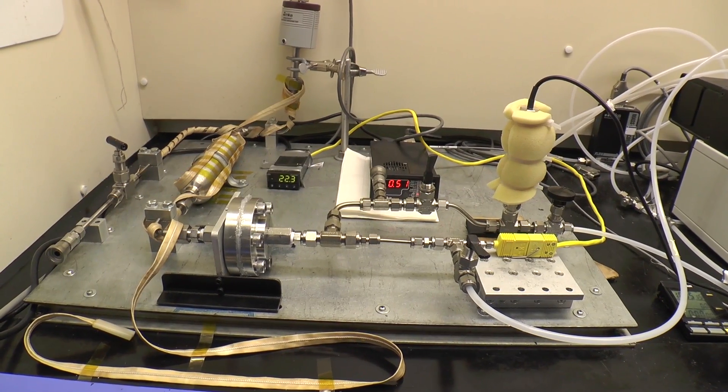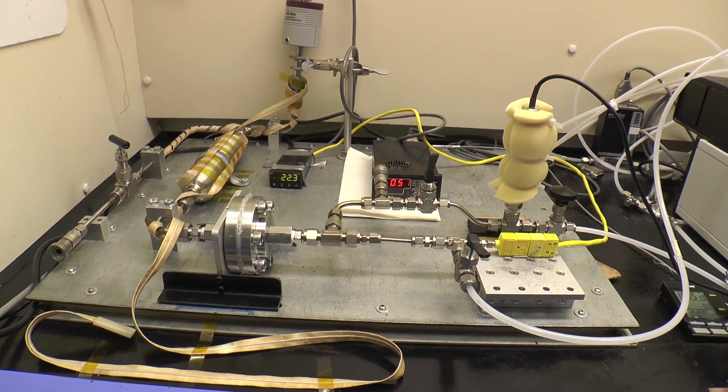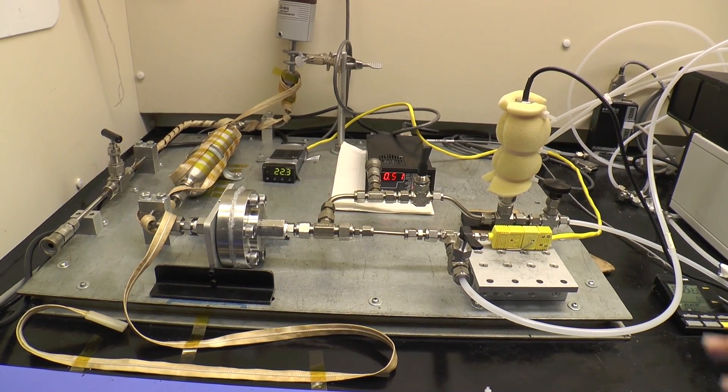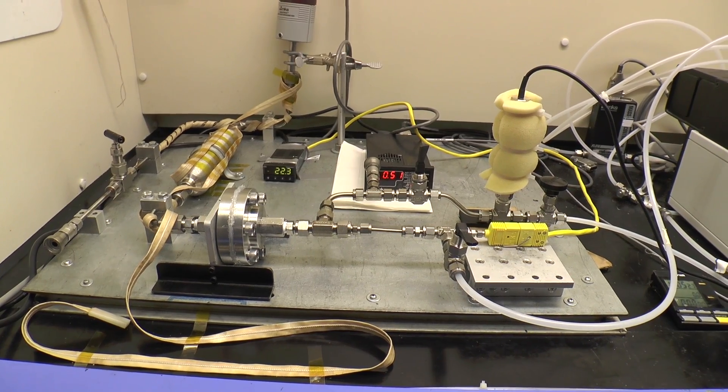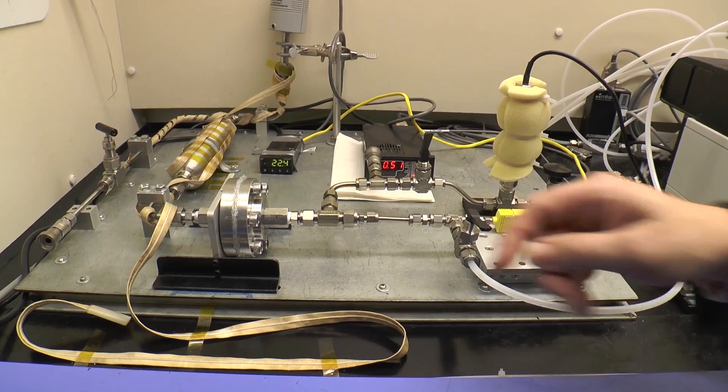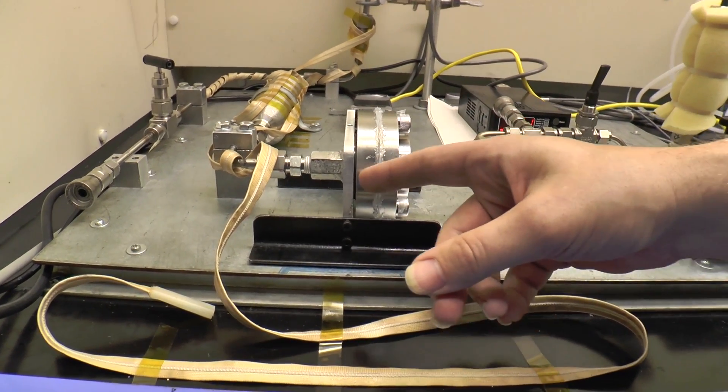This setup is a fundamental permeation cell that a graduate student from Alva Lugo's group put together. This allows us to measure the permeability of a single gas through a polymer film. That polymer disk is currently sandwiched between these two metal plates.